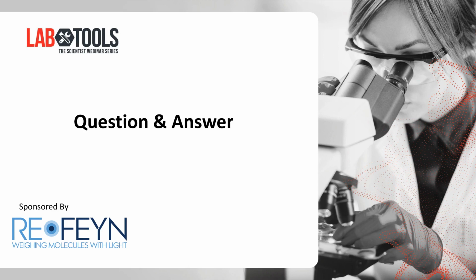That's a great question. Without revealing my hand too much, we're really interested in how antibodies and other immunogenic molecules, like other antibody formats, for example, interact with these viral proteins. We're quite interested in pushing this mass envelope higher and higher. So here I've shown data for just the spike trimer. We're interested in larger, maybe more realistic constructs that have more than one spike, maybe a pseudovirus or something. That's kind of what our dreams are, at least some of it.